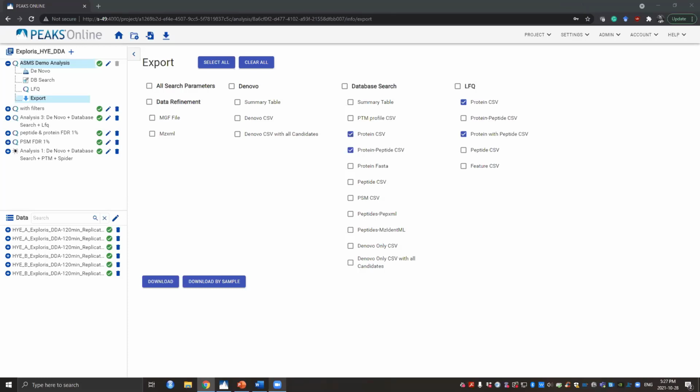In Peaks, our label-free quantification is ID directed. So basically, if you do have co-fragmented peptides, then Peaks should be able to identify them separately, and also it's going to be able to detect the peptide features. Hopefully they'll be far enough apart in terms of their m/z that we're actually able to deconvolute the two peptide features separately and create two separate peptide features from that.